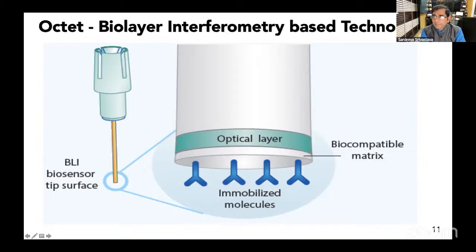So think about clinical samples. If these clinical samples are going to be utilized again for some application, then BLI can be a really strong approach, because you do the dipping and the interaction with the BLI and use the same sample for further protein extraction and peptide preparation for a mass spec-based approach. The same sample can be utilized for multiple applications. So BLI offers a couple of these advantages.